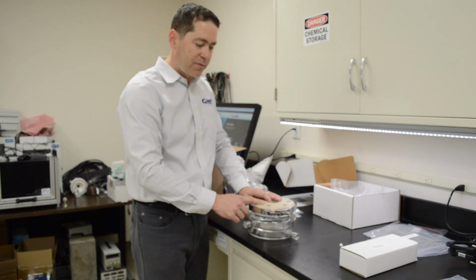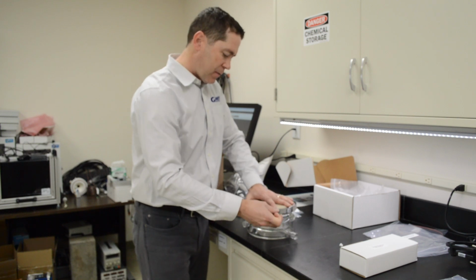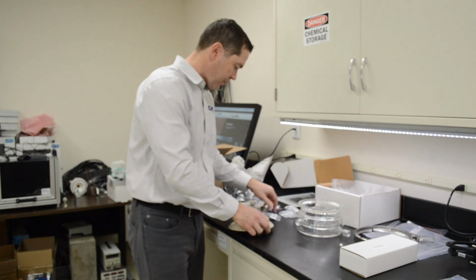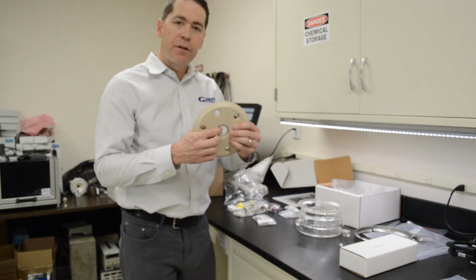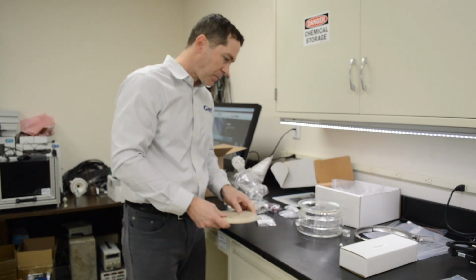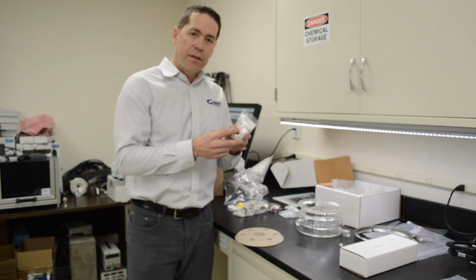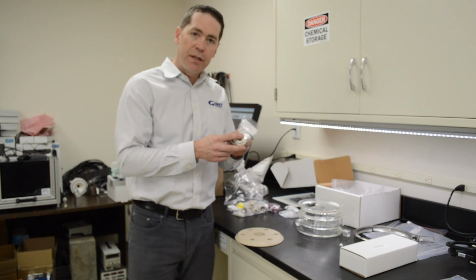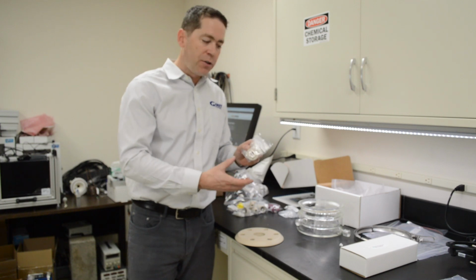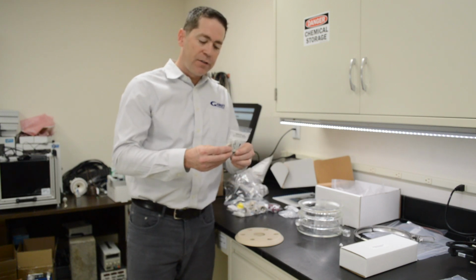So I'm going to take the lid back off just because it's easier to move into the camera to show you various ports and how they are used. So in the center here, obviously this is where, when this is mounted, your rotating cylinder comes down through. We have an adapter with a PTFE sealed bearing. So this bearing is meant to seal the entire cell so that you can blanket with gases if you need to, or if you want to pull out any reaction gases, you can do that. This seal is airtight.